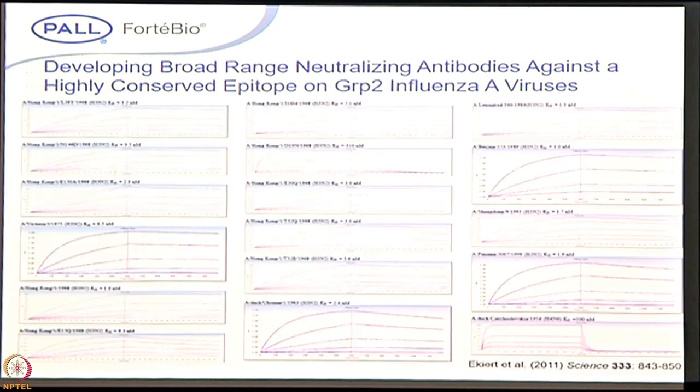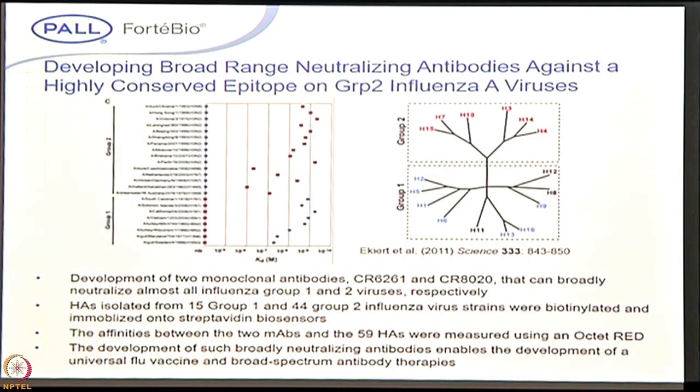If you look at this, you can see the binding interactions of the different antibodies to the respective hemagglutinins. From this, they developed the two broadly neutralizing antibodies. So very quickly, we can screen this kind of application using this.